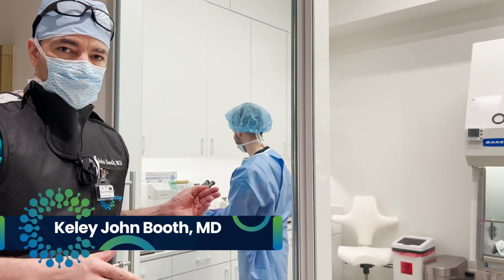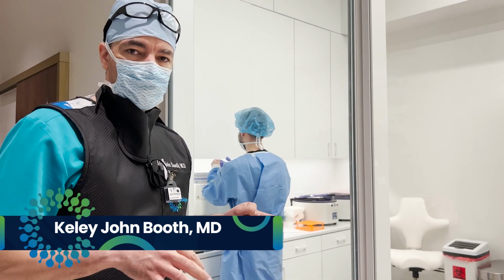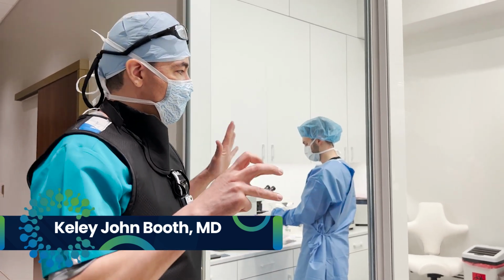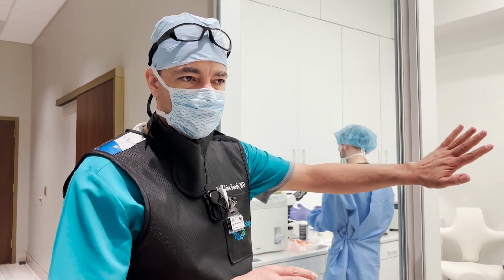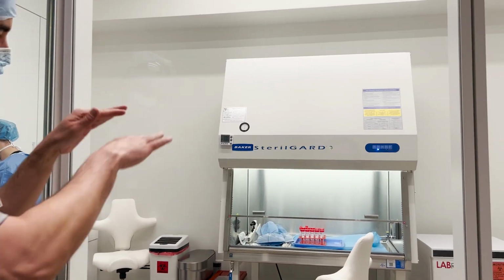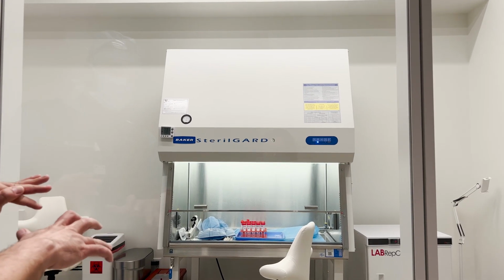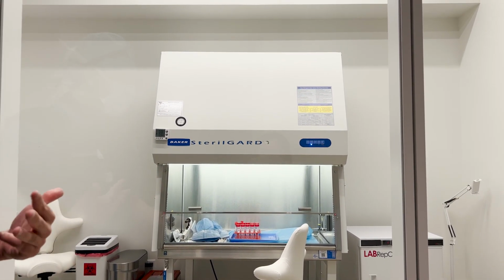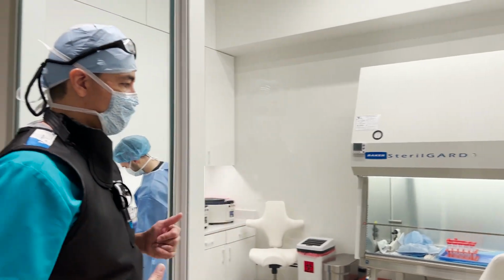Process the tissue in a manner that helps us essentially extract the most value out of the bone marrow and the cells and tissue. And we're able to separate this and actually process here in a sterile hood environment. If you step back, you can actually see what I'm talking about here. This creates a laminar airflow and is essentially what is done to produce, for example, if you're in a hospital and you're prepping things for patient use, this is what we would use.